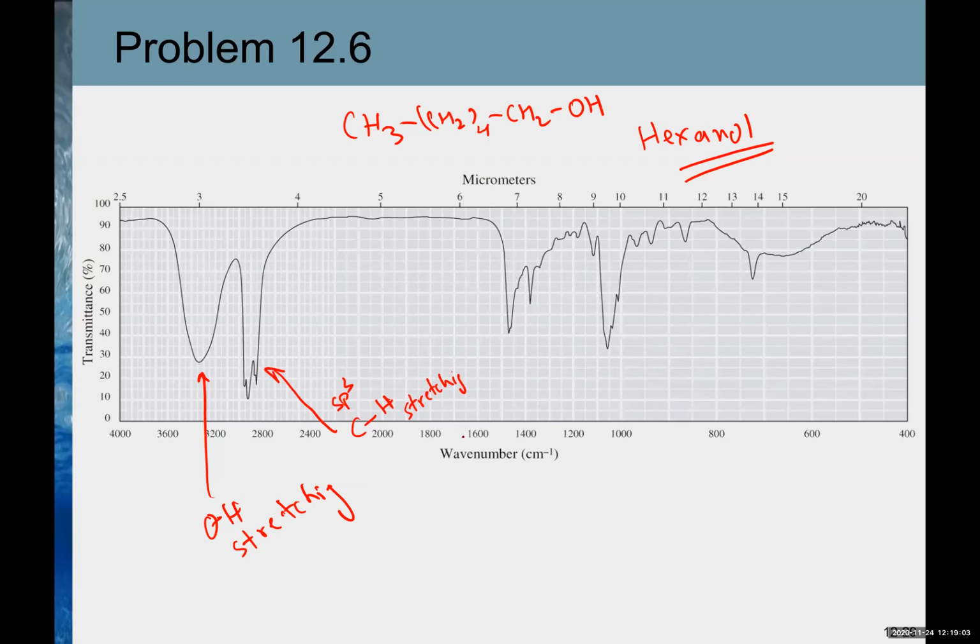So nothing from 1600 to that. How about this one? CH2 bending. Any other peaks you would like to label? Is that one CH3 bending? At what position approximately? Approximately 1380, maybe. Yeah, you are correct. Yep, this is CH3 bending. Any other peak, or is this it?